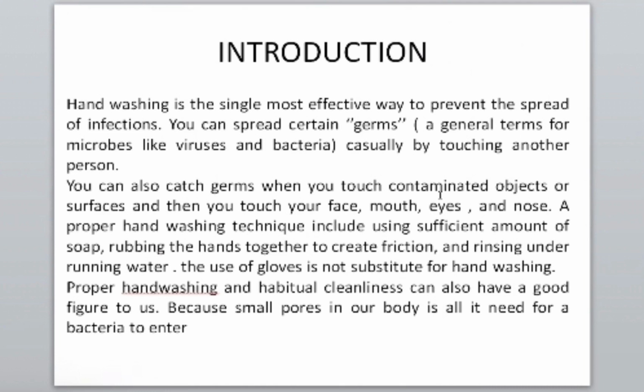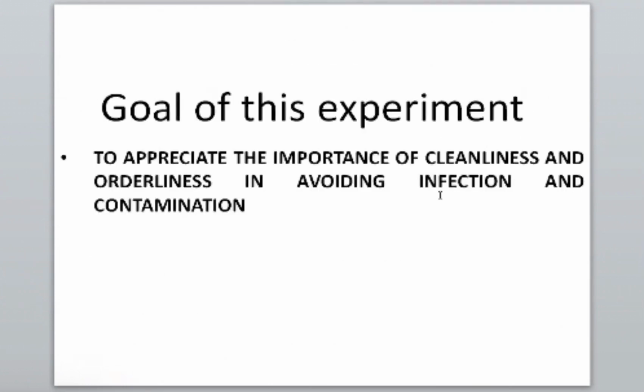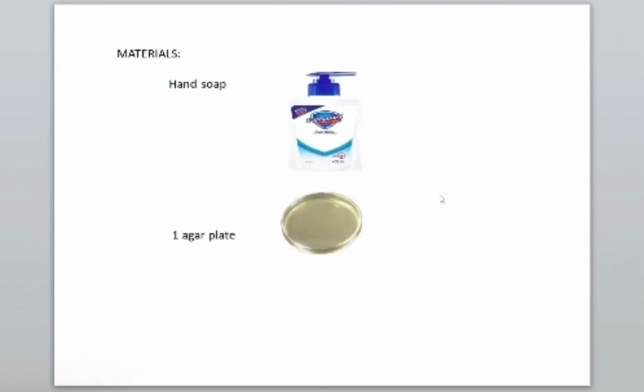Proper hand washing and habitual cleanliness can also be good for us as students of a medical course, because according to one of our instructors, small pores in our body are all it needs for a bacteria or other infectives to penetrate our body. So the goal of this experiment is to appreciate the importance of cleanliness and orderliness in avoiding infection and contamination.